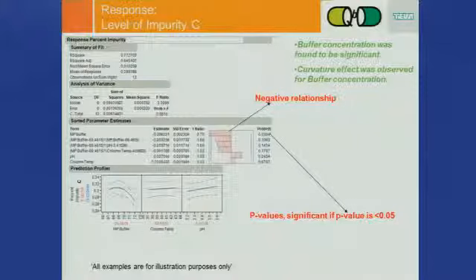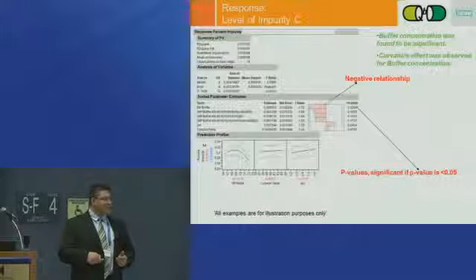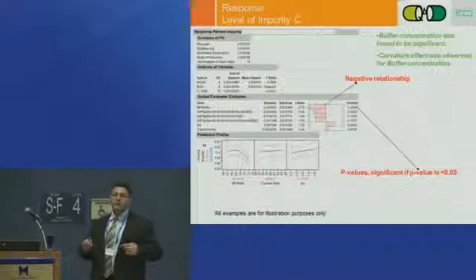There's a lot of variety of standard programs you can use. There's Excel, there's JMP. In this particular case, I think we use JMP. And you want to take a look at if there's any relationships and significance. Okay, you can have basically trends, but if they're not significant, then they're not critical. So the p-value has to be significant. And not only does it need to be significant, it needs to be of a big magnitude.